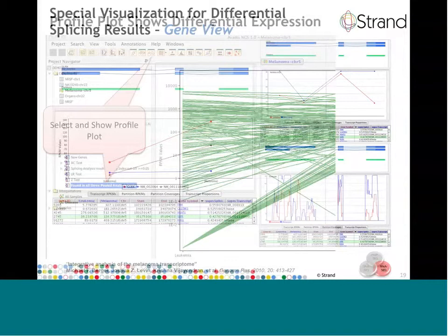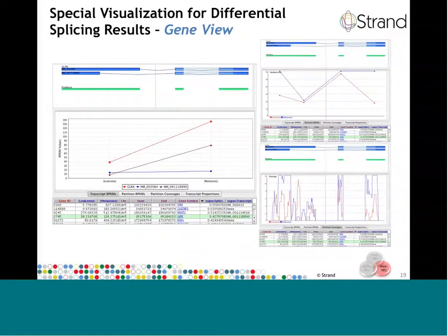But profile plots only really show half the story. We all know that it's not the gene that is expressed, but its constituent transcripts. While showing the profile plot for each of the transcripts is feasible, it soon becomes difficult to visualize this amount of data. If we assume, as many have, that each gene can result in an average of 10 transcripts, we can expect to see over 250,000 transcripts if all genes were active at one point. Avadis NGS contains an algorithm that will determine which of the transcripts is differentially spliced, and the results of a typical analysis is shown here.